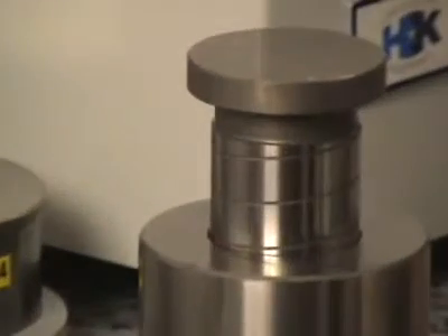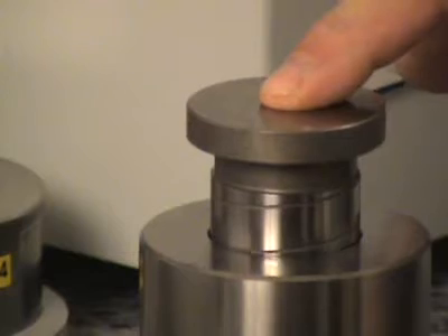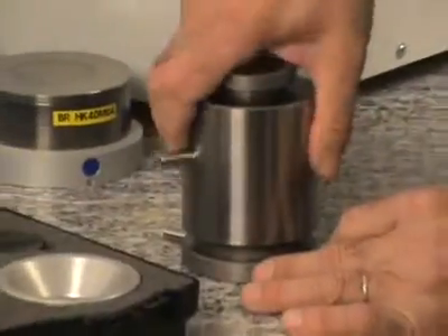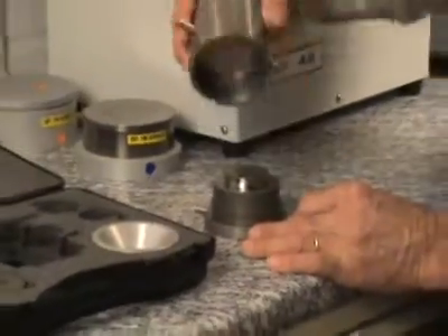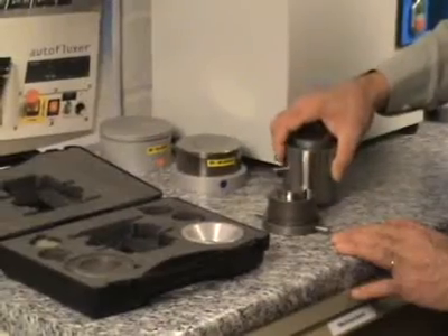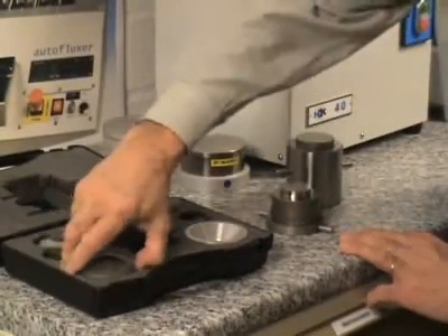Die sets are high precision mechanical tools. The die set here is disassembled, and the set contains an extraction tool as well.